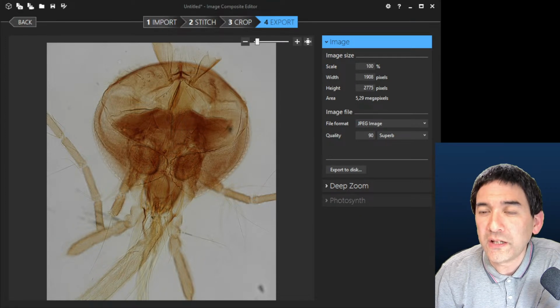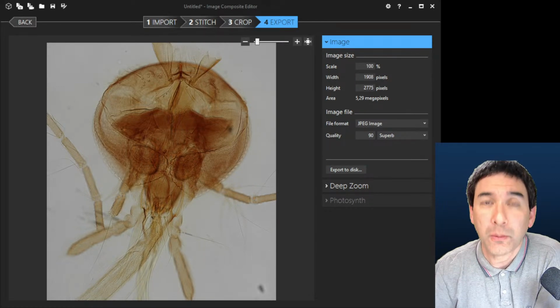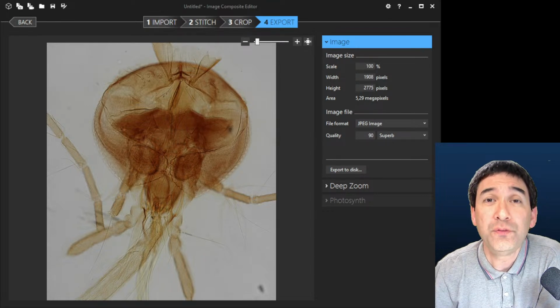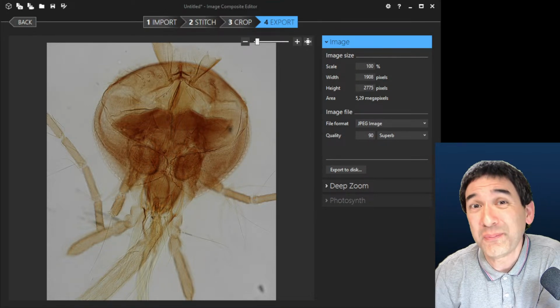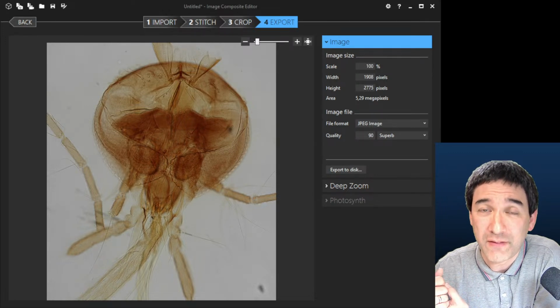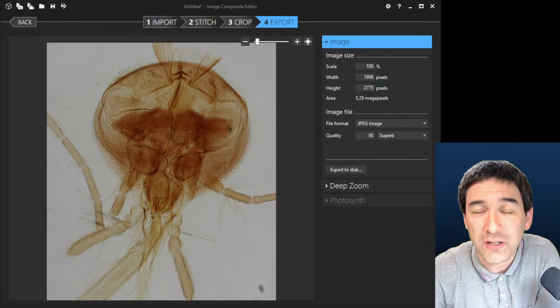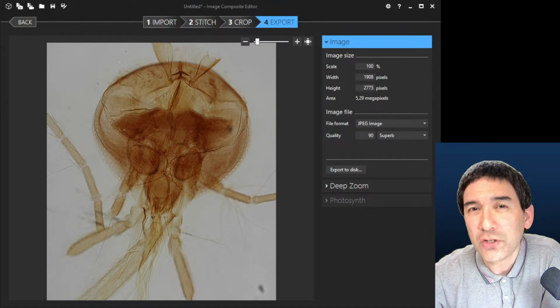Would the image quality be better if using still images compared with a video? I would say probably yes, and for 2 reasons. First of all, if you use still images, then you automatically have a higher resolution because the photographs have a higher resolution. Here you only have full HD, so the pixel resolution is lower. However, that's not really the issue.